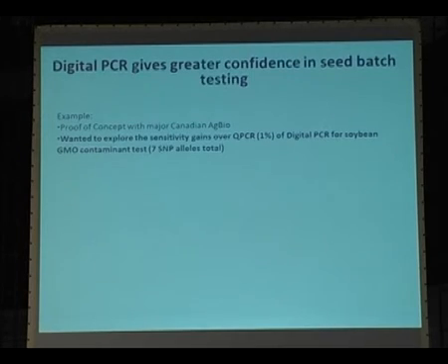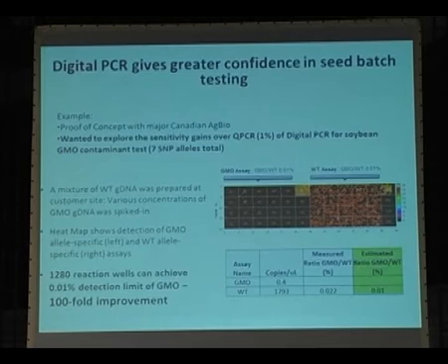So they selected 7 SNP alleles that they wanted to discriminate and engaged us for a proof of concept study on the Open Array plate. Now, in this study, essentially what we did is we took that background wild-type DNA and we spiked in the contaminant DNA at a range of different concentrations, all the way down to a 1 in 10,000 or 0.01% concentration.